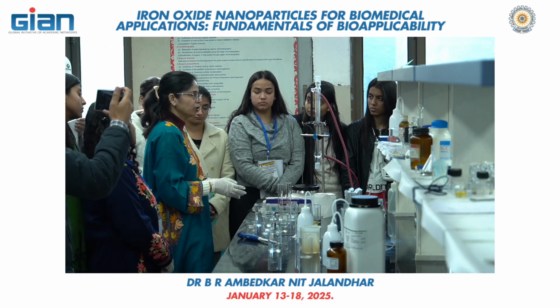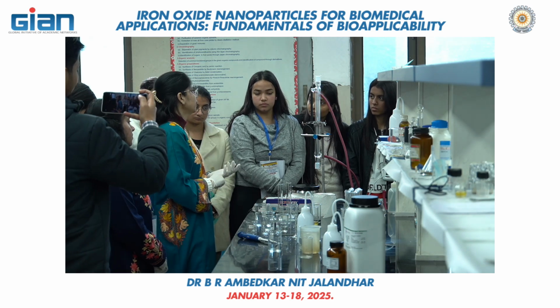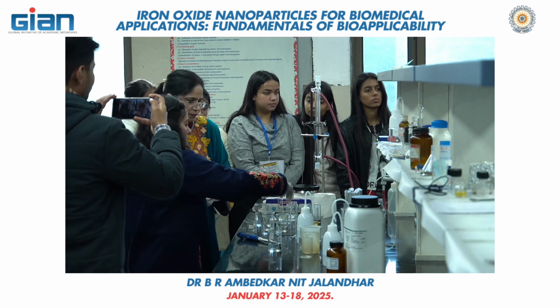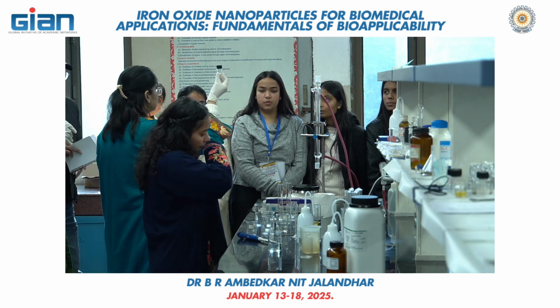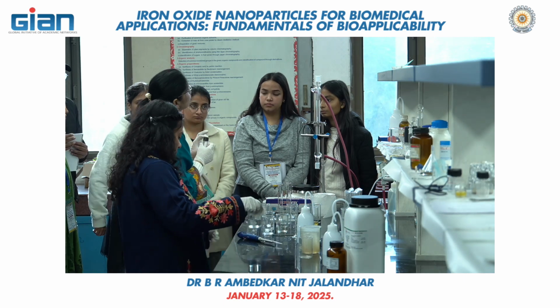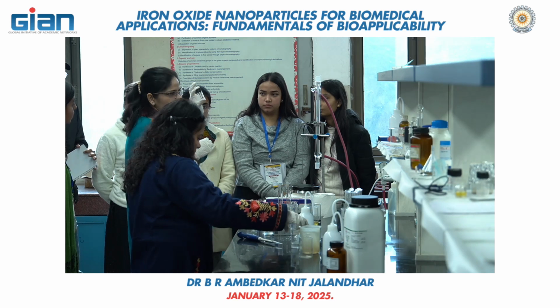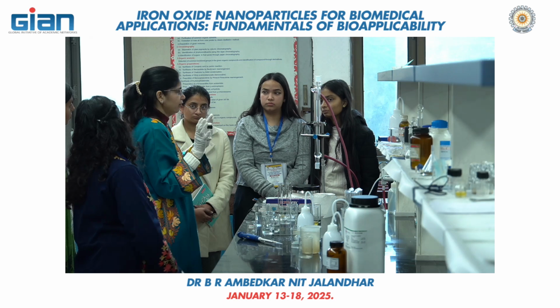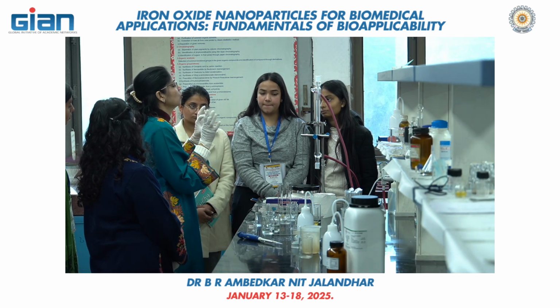As I already told you in the morning, you can read the research papers and get more ideas. You can start now one by one. You can keep your samples in the vials, right? These nanomaterials which you synthesize today will be used in your last tutorial number 5. You don't need to throw them away or waste them, because silver and gold are costly. These suspensions will be used on the last day.